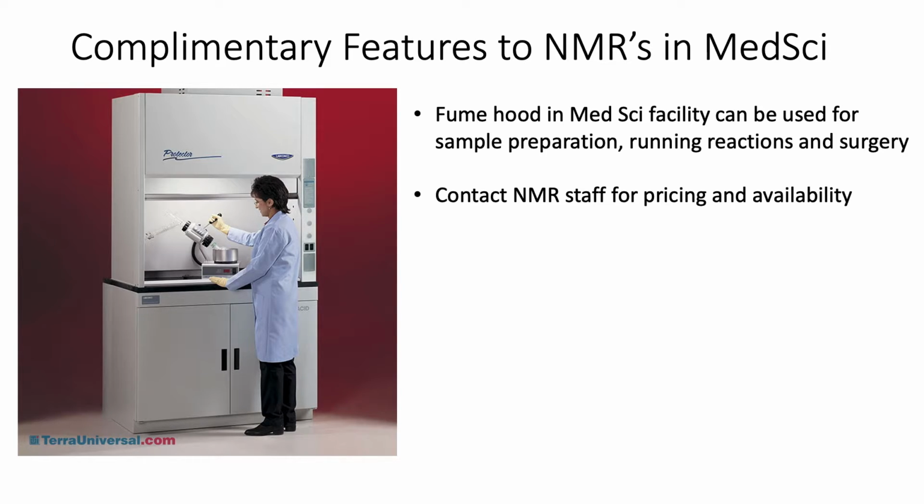Keep in mind that the fume hood area does need to be rented, which costs money, and you need to contact the NMR staff for pricing and availability. But that is something that this facility has that Chemistry 93 doesn't have, since we don't allow any sample preparation or open chemicals in Chemistry 93.